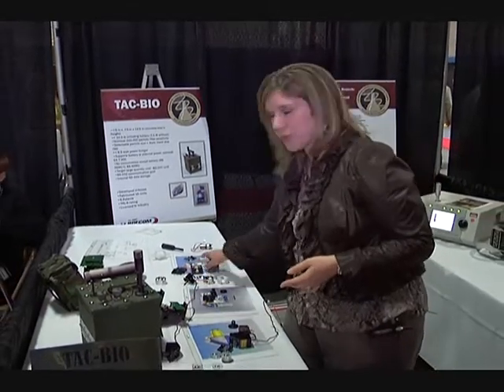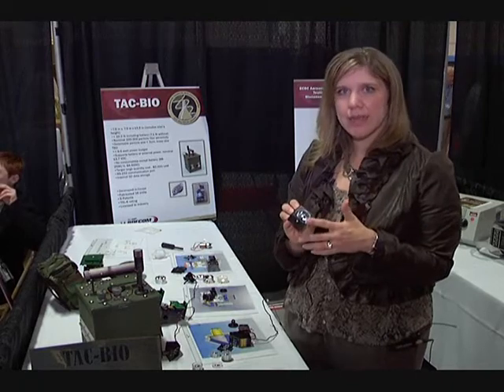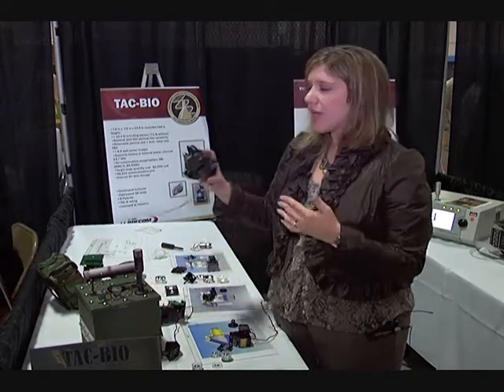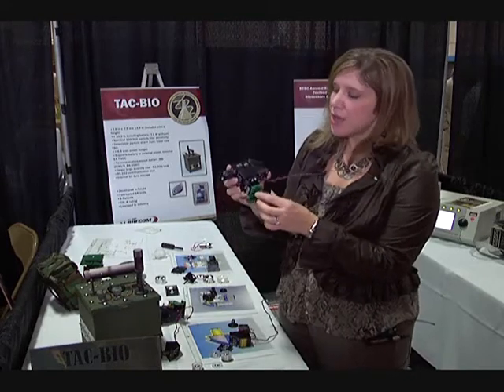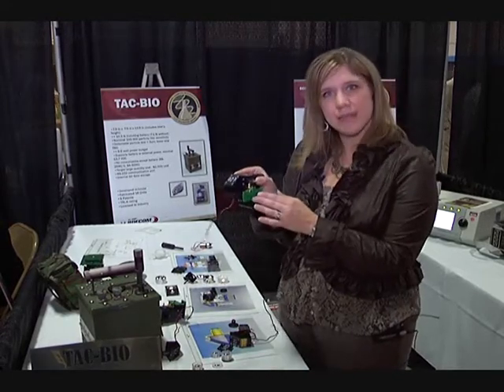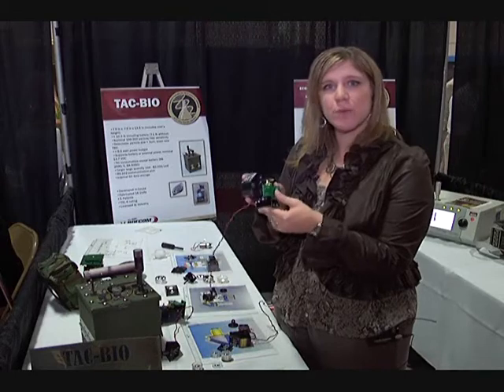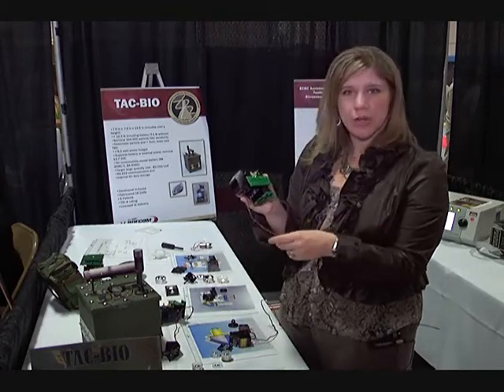The air comes into a collection optics chamber where it's interrogated. Once it goes into the collection optics chamber, the light fluoresces the particle, and then that light is deflected into these photomultiplier tubes. This will detect our fluorescence and our elastic scattering. The data from the photomultiplier tubes we are able to use in our algorithm to determine whether or not it's a biological agent or if it's say pollen or dirt — simply an interferent.